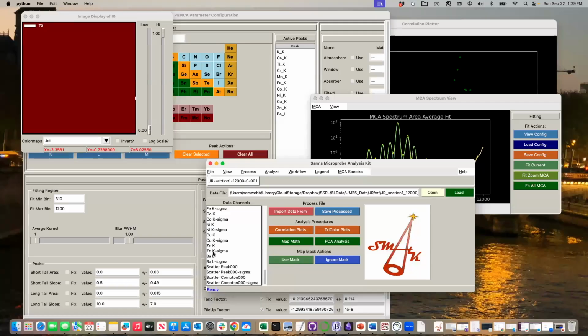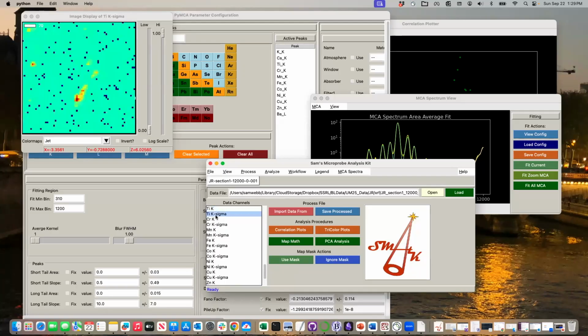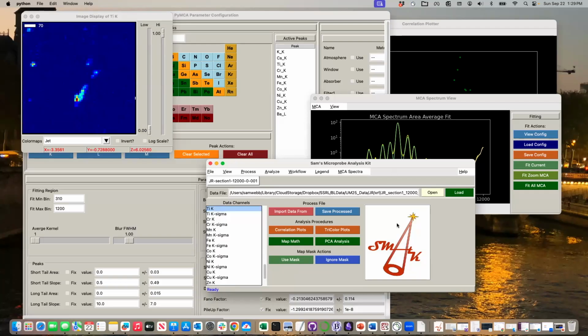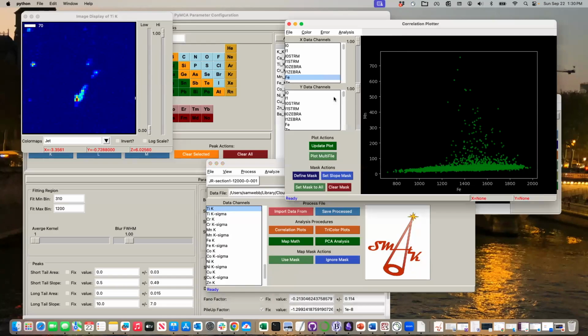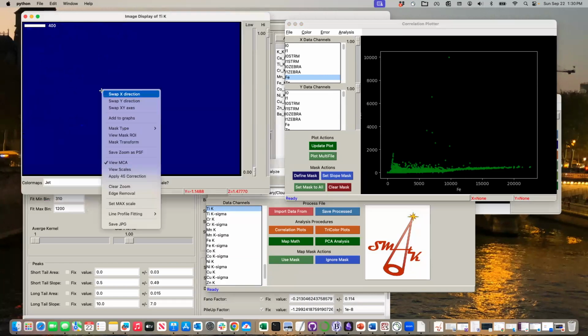And now we can say, oh look, was that really barium? Maybe a little bit there. So maybe I was much ado about nothing there, but there's still titanium, maybe a little bit of air there still. Maybe it got a little bit better. But now let's go back to our first question that we had, or we thought we had, at least. So here's that iron manganese curve. Let's zoom back out. Clear. And we'll do our edge zoom.